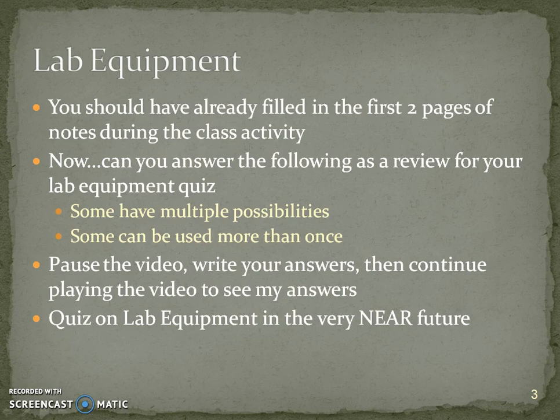Now, can you answer the following as a review for your lab equipment quiz coming in the very near future? Some of them have multiple possibilities. The answers that I'm going to give you could be different than the ones that you thought of, but that doesn't mean that they're wrong. And of course, some things can be used more than once, like a beaker has multiple uses, so maybe that answer is going to be used more than once. So right now, pause the video, write your answers, then continue playing to see mine.